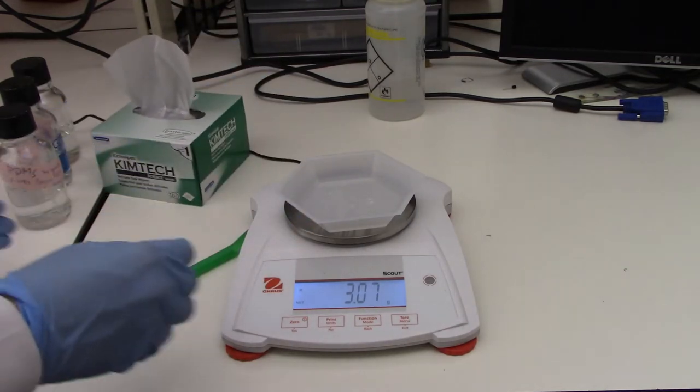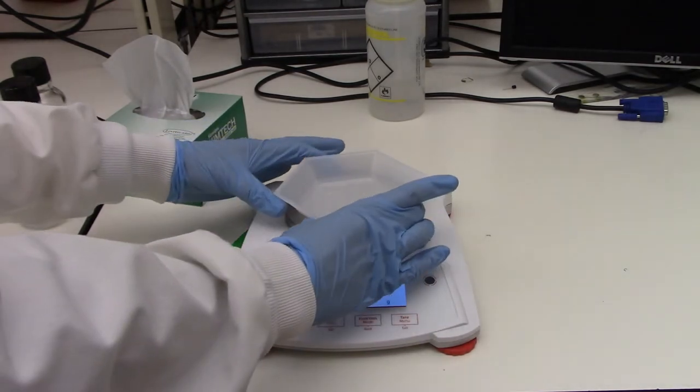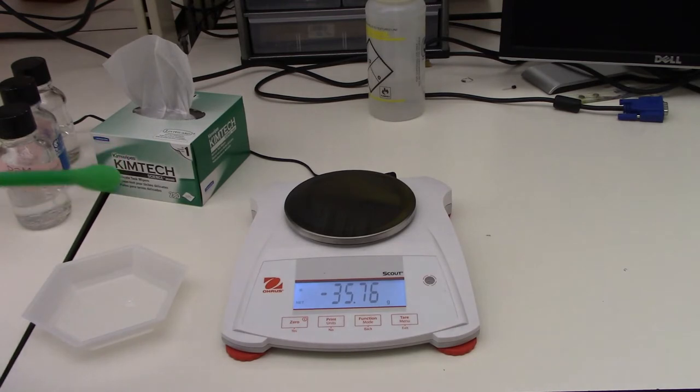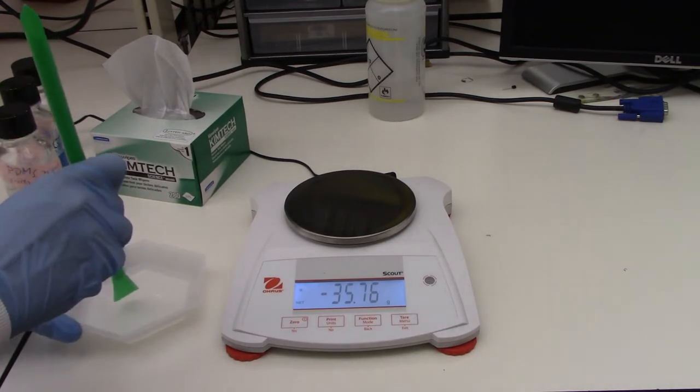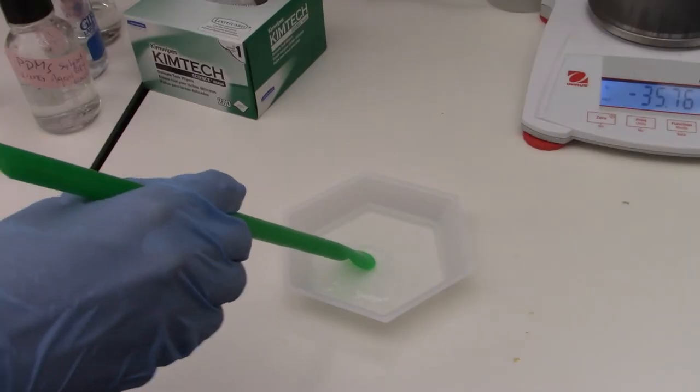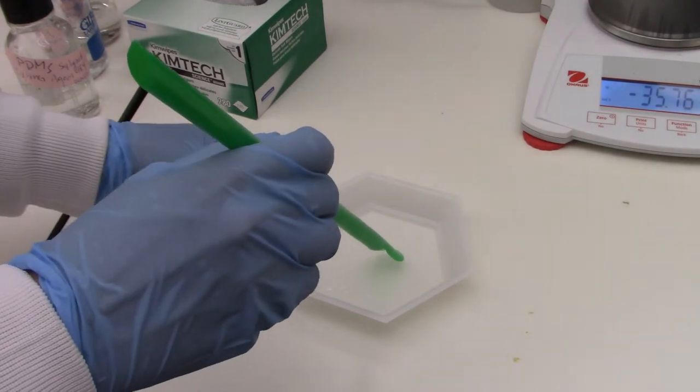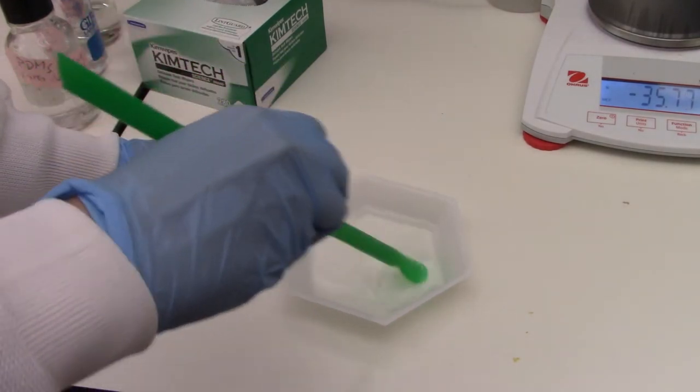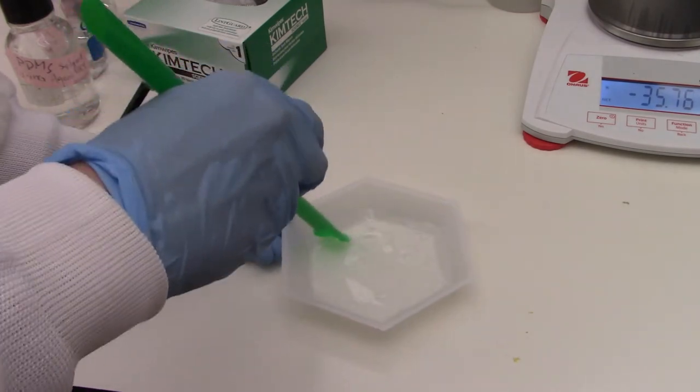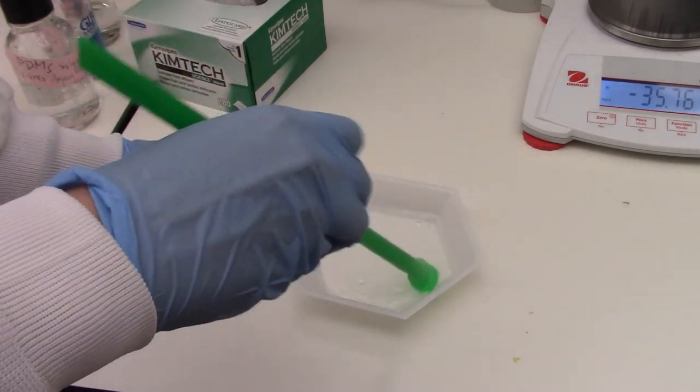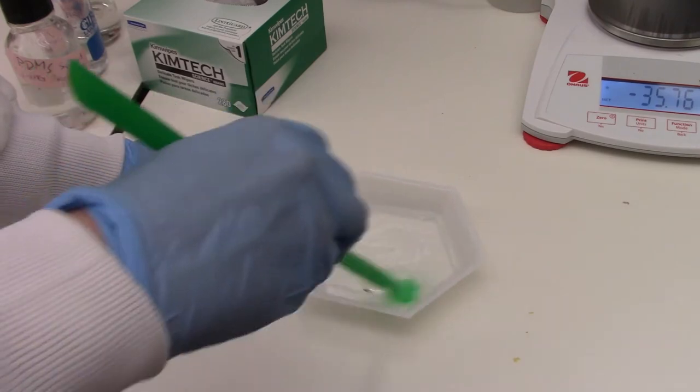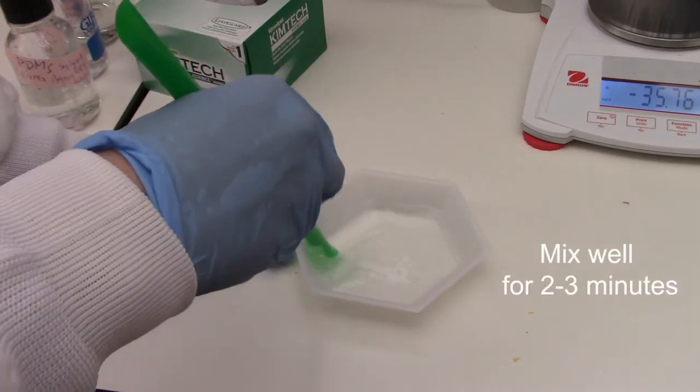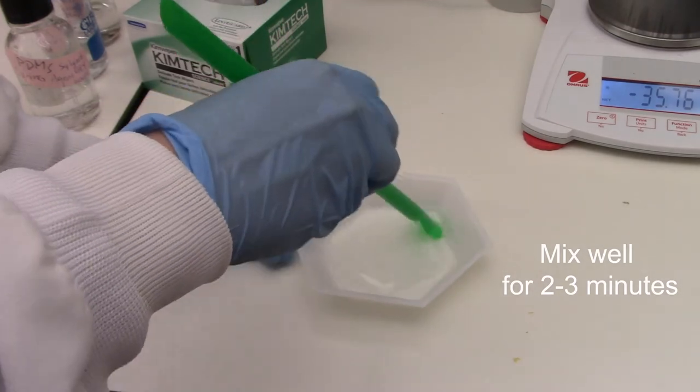So then the next step, I'm going to take, we've got our PDMS base and curing agent. So I'm going to take this off the balance and then rigorously mix. Now we're going to mix our base and curing agents together. So mix somewhat rigorously, but also for at least a minute or two. Basically, the goal is to make sure that these two components are mixed very well. Otherwise we'll have problems later in our manufacturing.